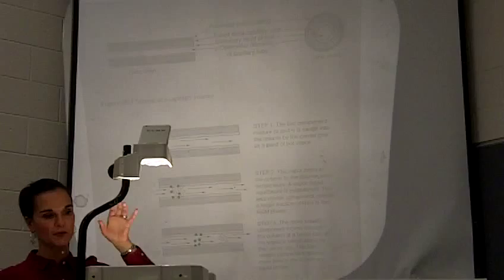All right. So first of all, the inside of this capillary column, and the capillary column is like a little bit bigger than the size of a hair.